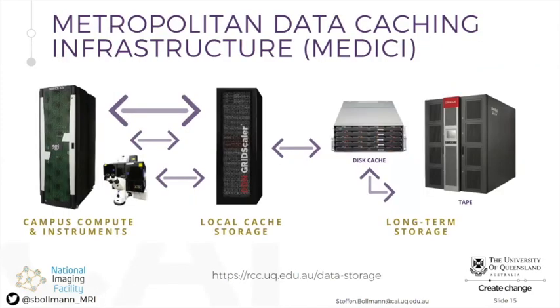So at the University of Queensland, where we work, we saw this problem coming a few years ago, and we came together in a big group, and we built a data infrastructure fabric across the whole campus. So we basically connected instruments that acquire the data, so could be microscopes, MRI systems, with a decentralized data storage fabric. So we can basically push data from the instrument to this fabric, and then it gets automatically mirrored to the system where you want to use the data.